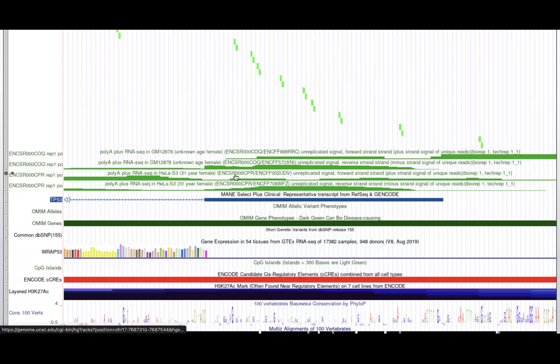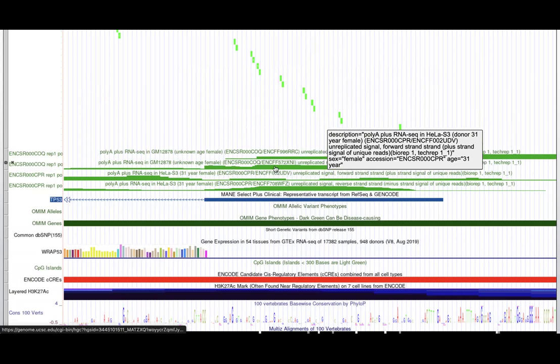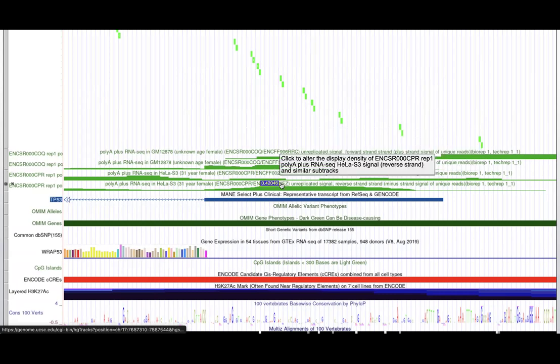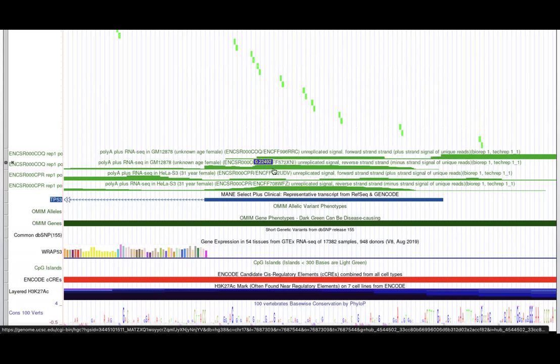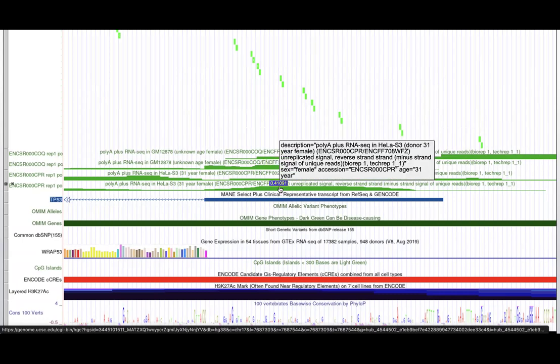All right, and here they are. They should be added right up against the previous two that we have here. And you can note now that on both reverse strands, this one and this one here for both cell lines, they both have a relatively high level of transcription within the transcription start site region of TP53. And so this visual comparison already suggests a relationship between methylation and expression.